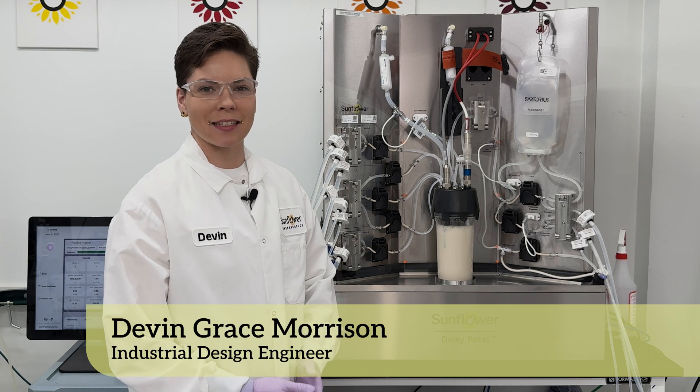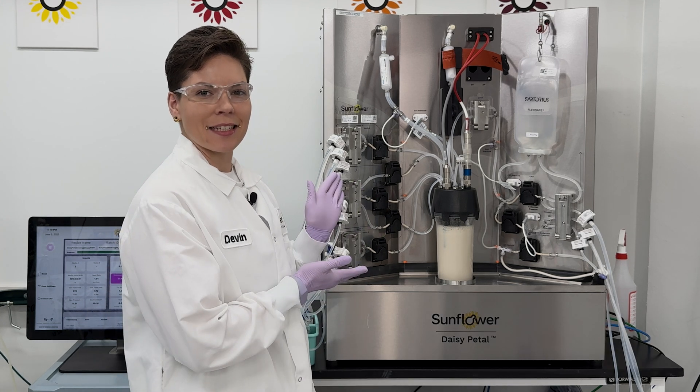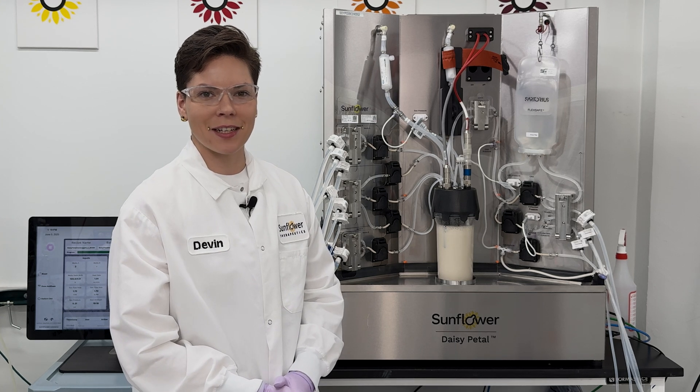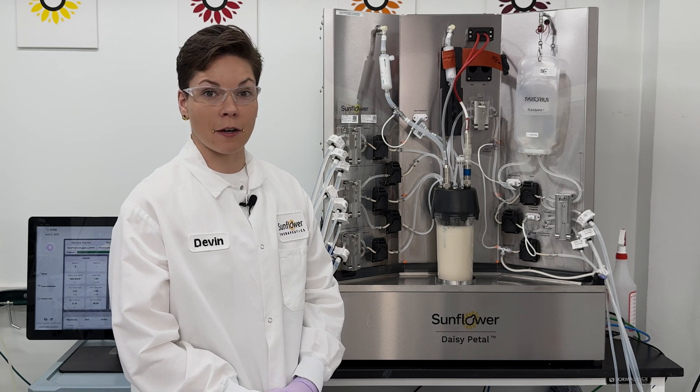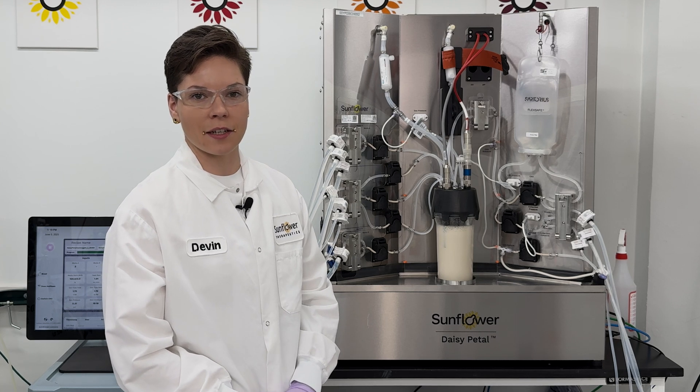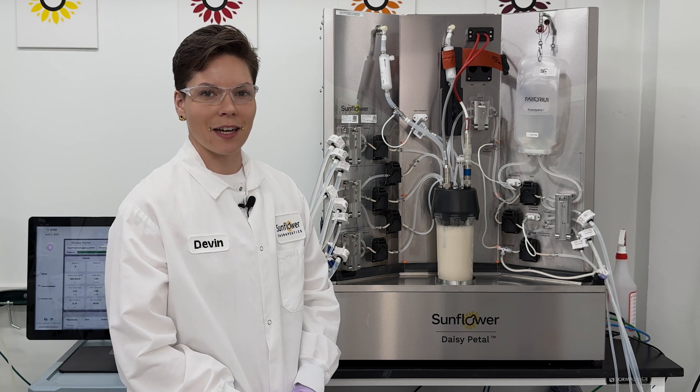Hi, I'm Devon, an industrial design engineer at Sunflower Therapeutics, and this is the Daisy Petal Perfusion Bioreactor System, which I helped design. The Daisy Petal System is fully operational upon delivery and it arrives with all of the auxiliary equipment that you need to get your perfusion process up and running. Let's take a look.